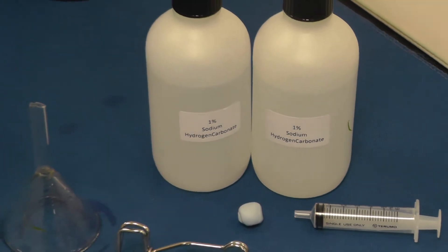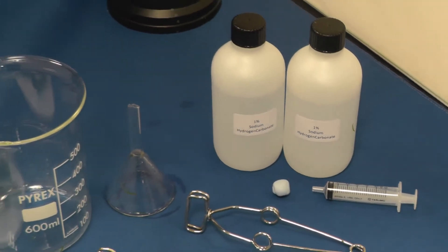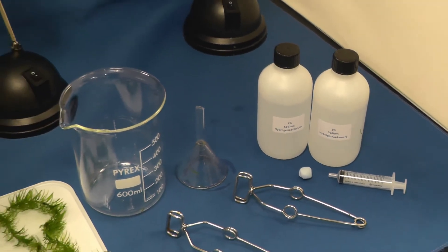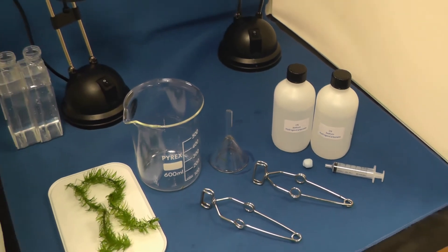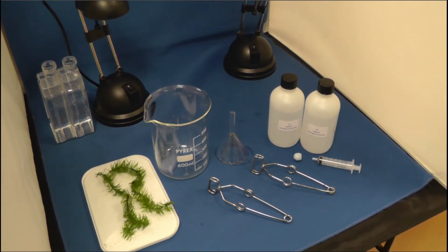To set up a bubbler you will require sodium hydrogen carbonate solution, a beaker and glass funnel, something in which to collect the oxygen gas. A syringe barrel capped with blue tack is good for this, a light source, and a couple of sprigs of the plant.